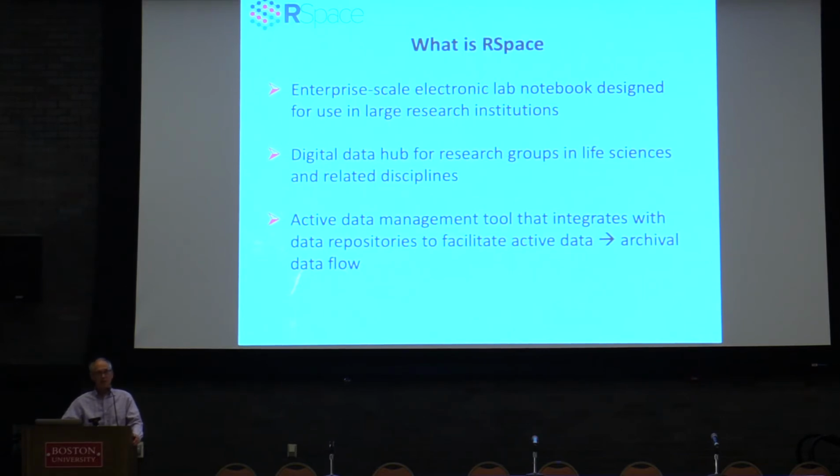Well, you can also think of it as a digital data hub that's used by research groups in the life sciences. It's Google Docs for science with lots of bells and whistles. There's lots of different ways to think about it. And coming back to one of Mercedes' themes, it's also an active data management tool, which we then integrated with an archival data management tool, Dataverse.